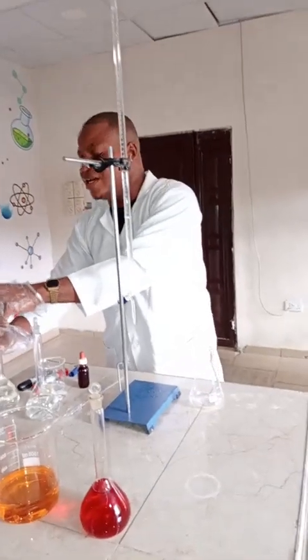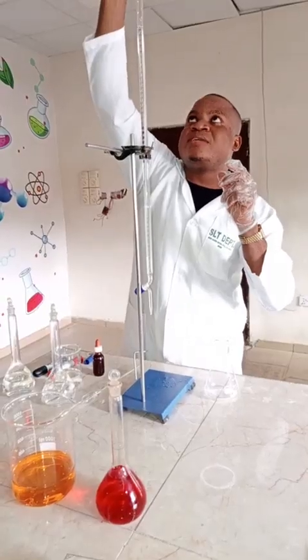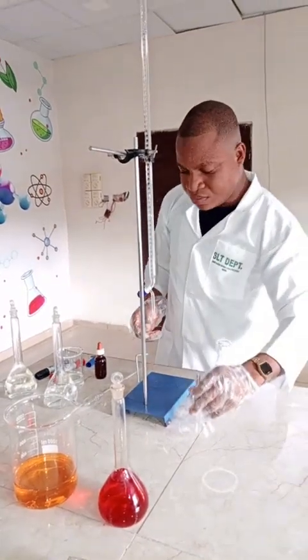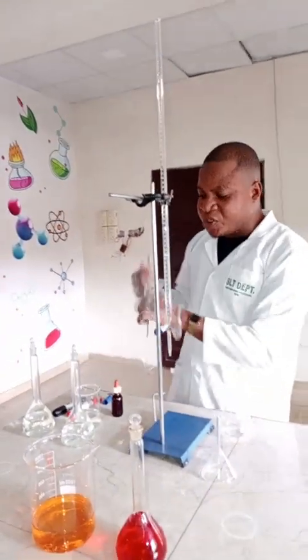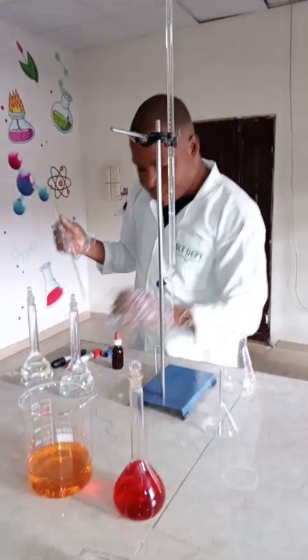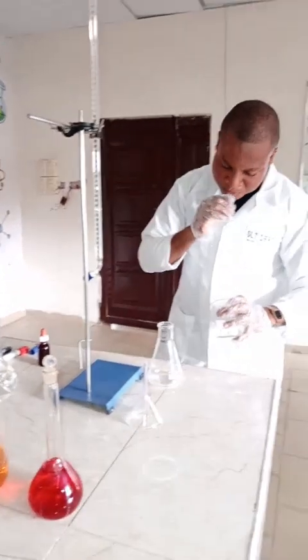Sorry, for the first I didn't take away the funnel, the glass funnel. So I'm going to do that right away before titrating. Now I'm going to take another 25 ml portion of the base. From this, I'm going to prepare another 25 ml of the base.